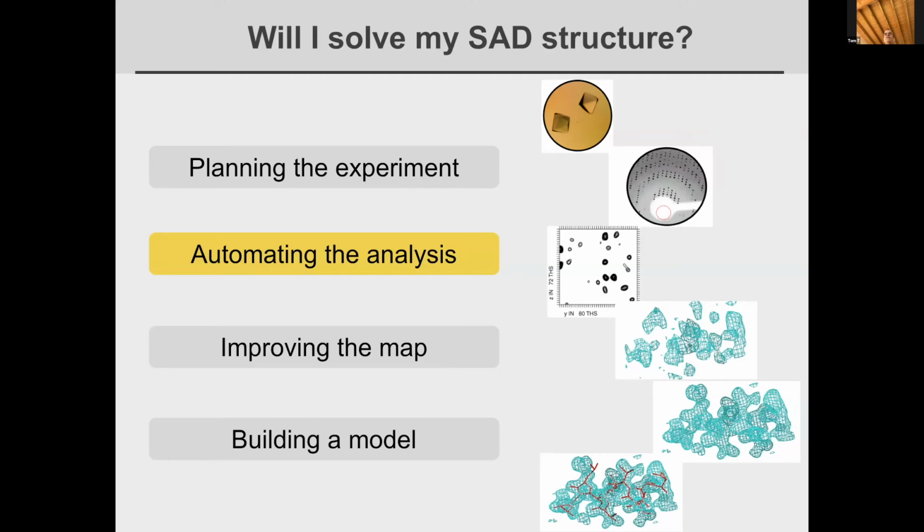If you have errors that are systematic and you measure replicates of the same thing, you get the wrong answer, but very precisely, that is, you get the exact wrong answer every time. If you have errors that are more or less randomly distributed and not systematic errors, then you measure many times, you get a better answer. You get closer to the true answer.